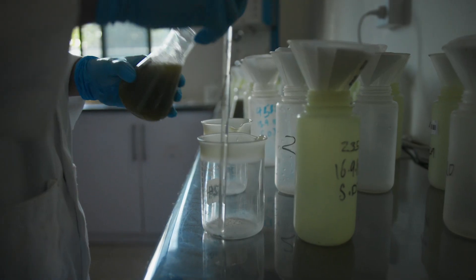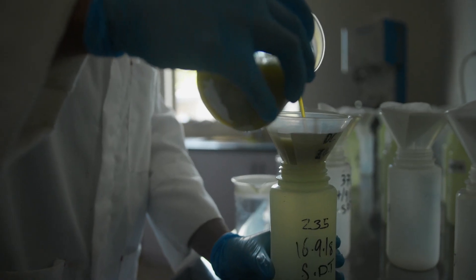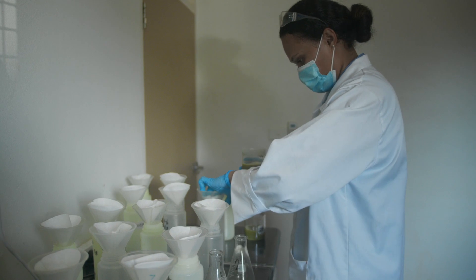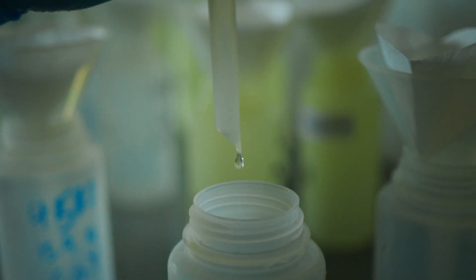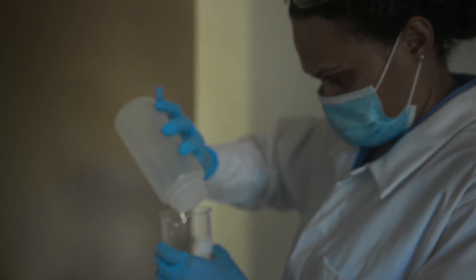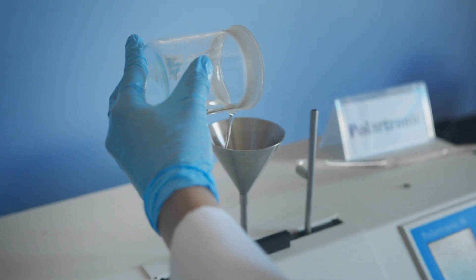That juice analysis is further filtered using chemicals. And then the reading is taken on the polarimeter instrument so that we are able to know the purity of the cane samples.